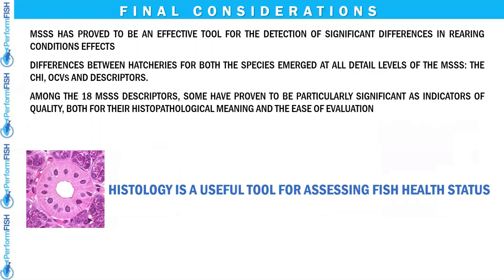Some final considerations, but just one consideration. Yes, we believe that histology is a current, powerful, and useful tool for assessing the health status of fish, even with fairly quick turnaround times.